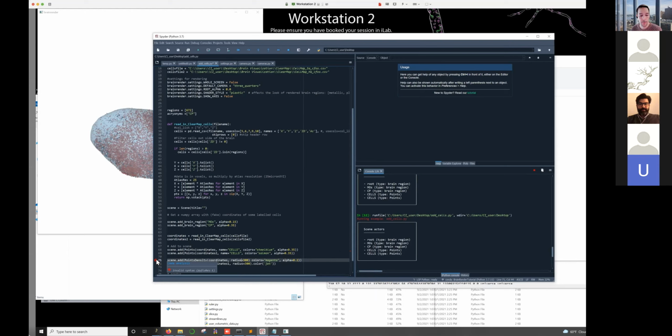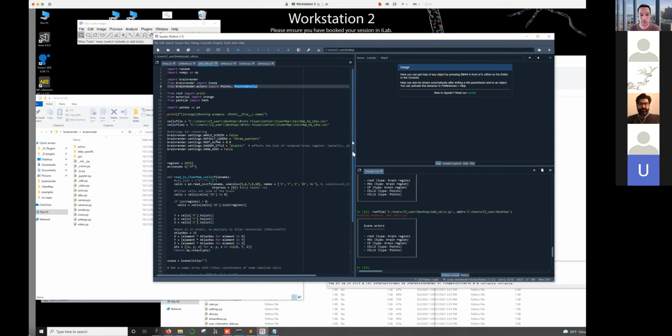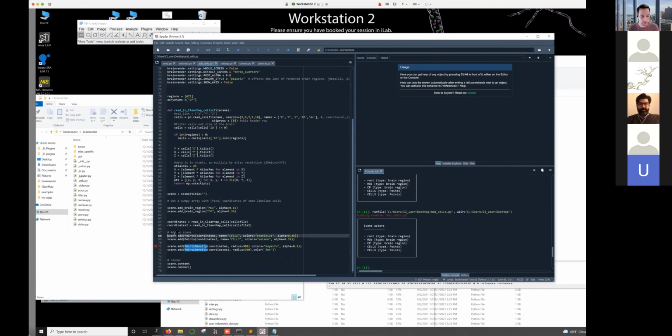You can see there's a warning here. This is because we haven't pulled in this points density. I think we just need to add this in. And I'm just going to turn off these individual ones. Let's just get this basic thing working and we'll fix the colors.